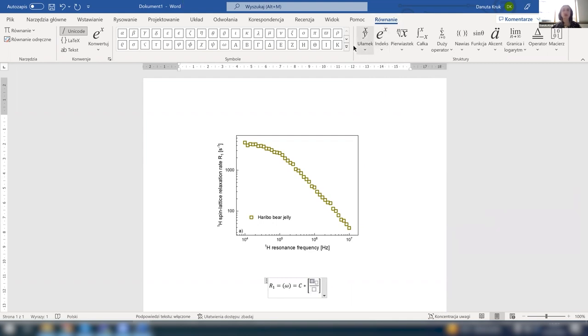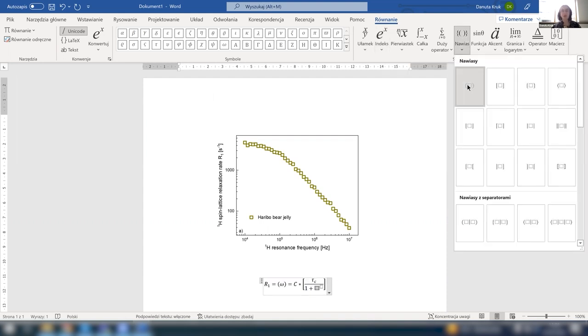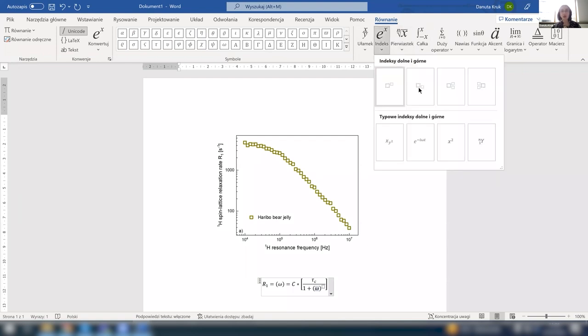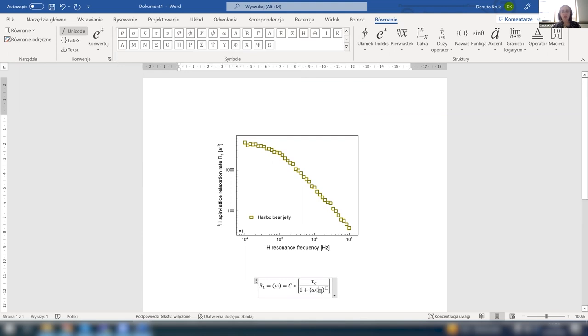So here we had a correlation time, and here we had such a quantity. Sorry for writing it now, but maybe you write it in this way. You will also like it because we'll be proceeding quite slowly, and there will be time to get some insight into that. And actually, I'm almost finished.